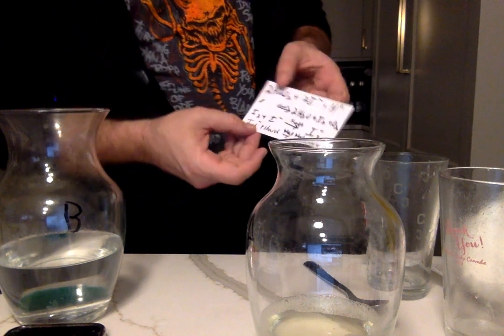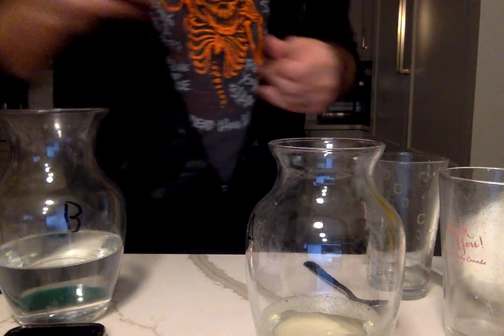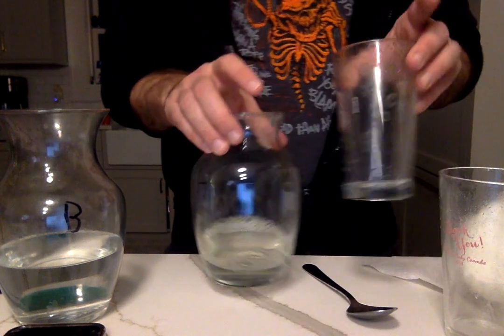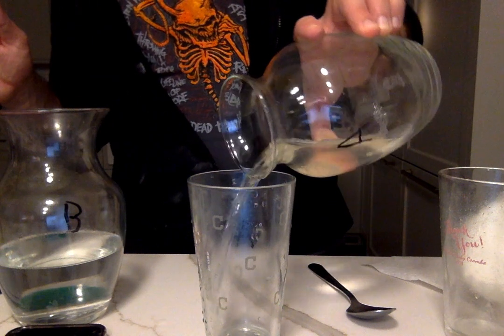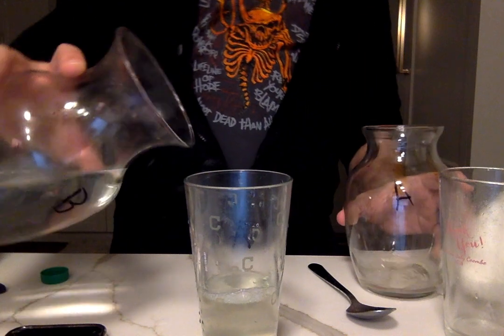And when that happens, we have the triiodide plus the starch. It's going to give us a black and blue triiodide solution there. So this is what we're going to do. We are going to pour a little bit in here, keep our fingers crossed that this works. I'm going to use equal parts of both.